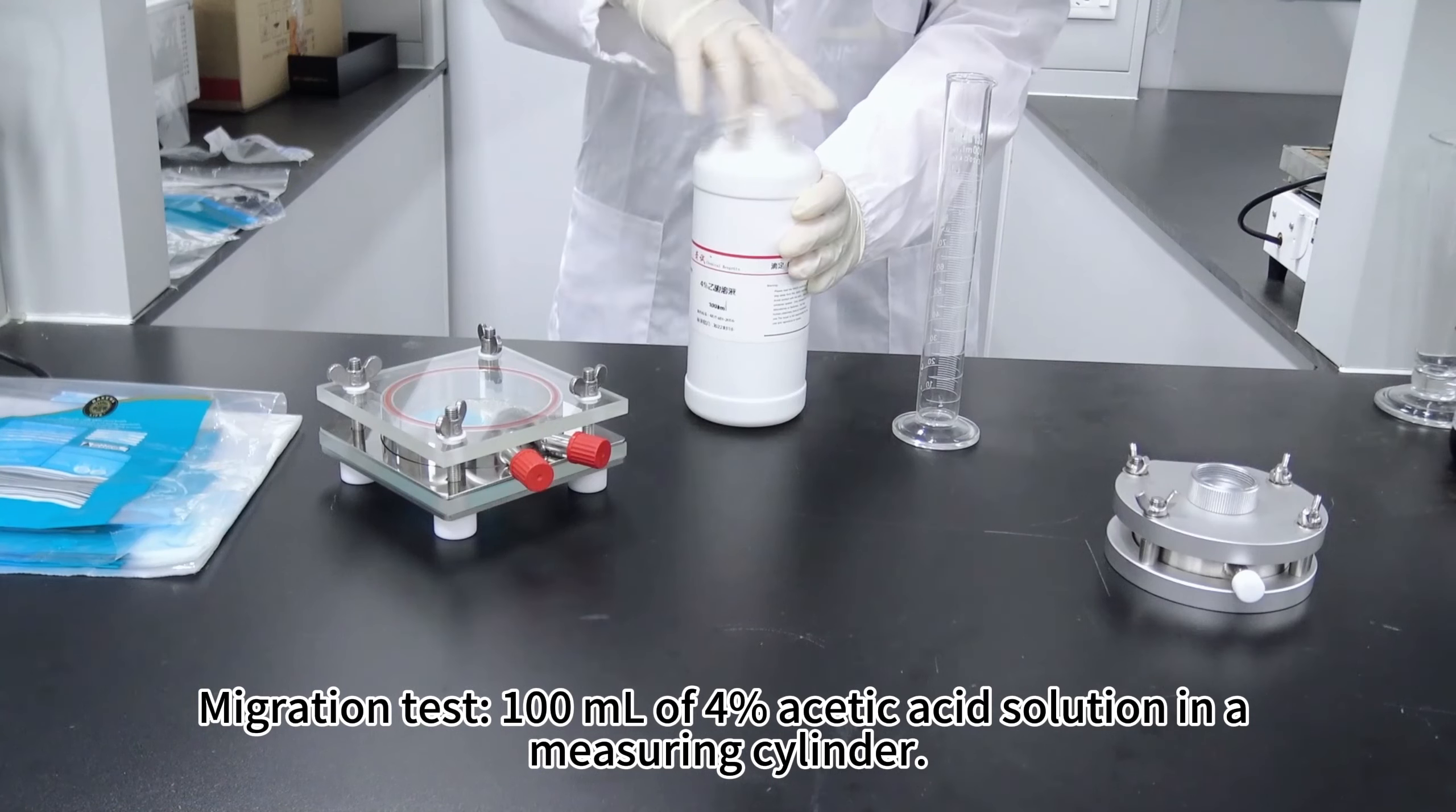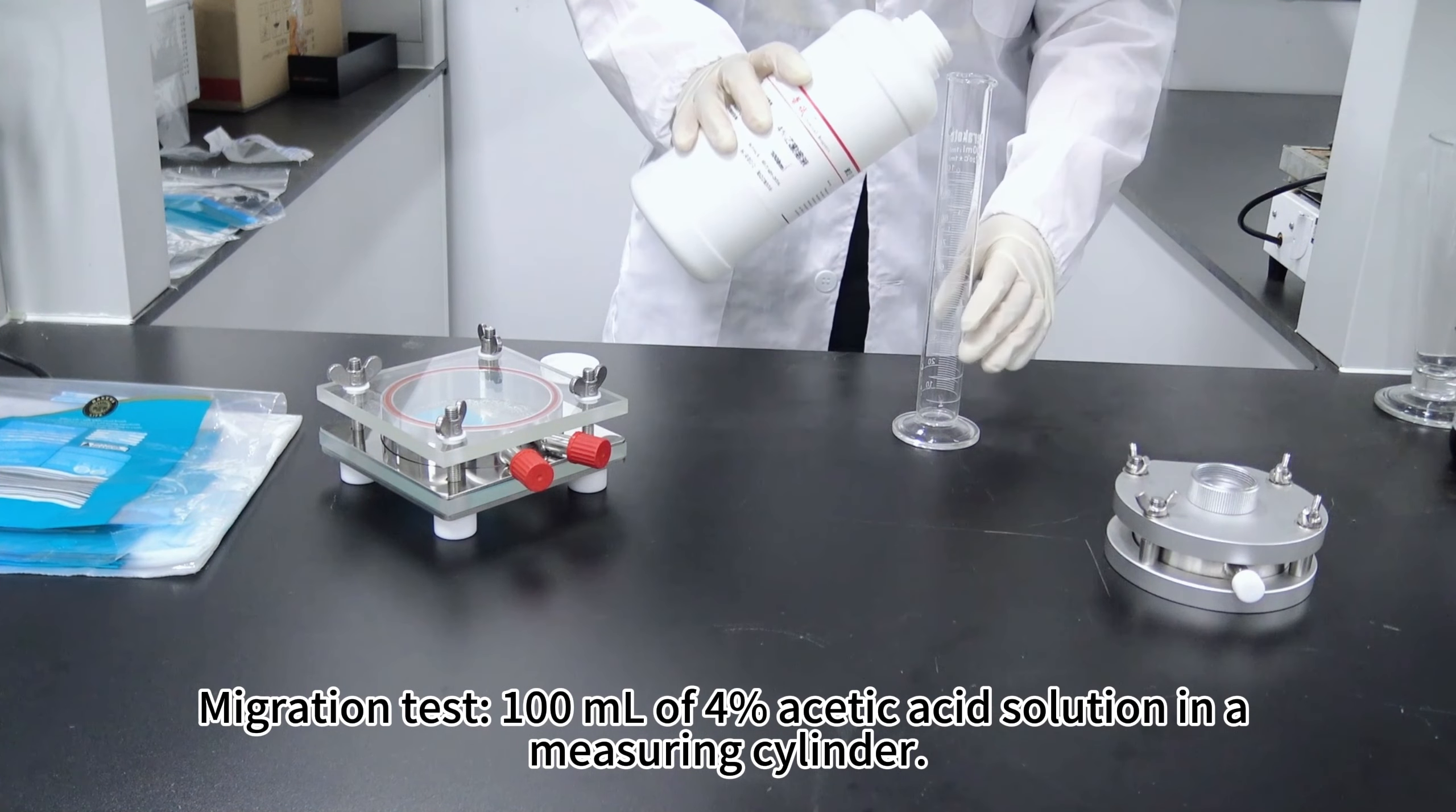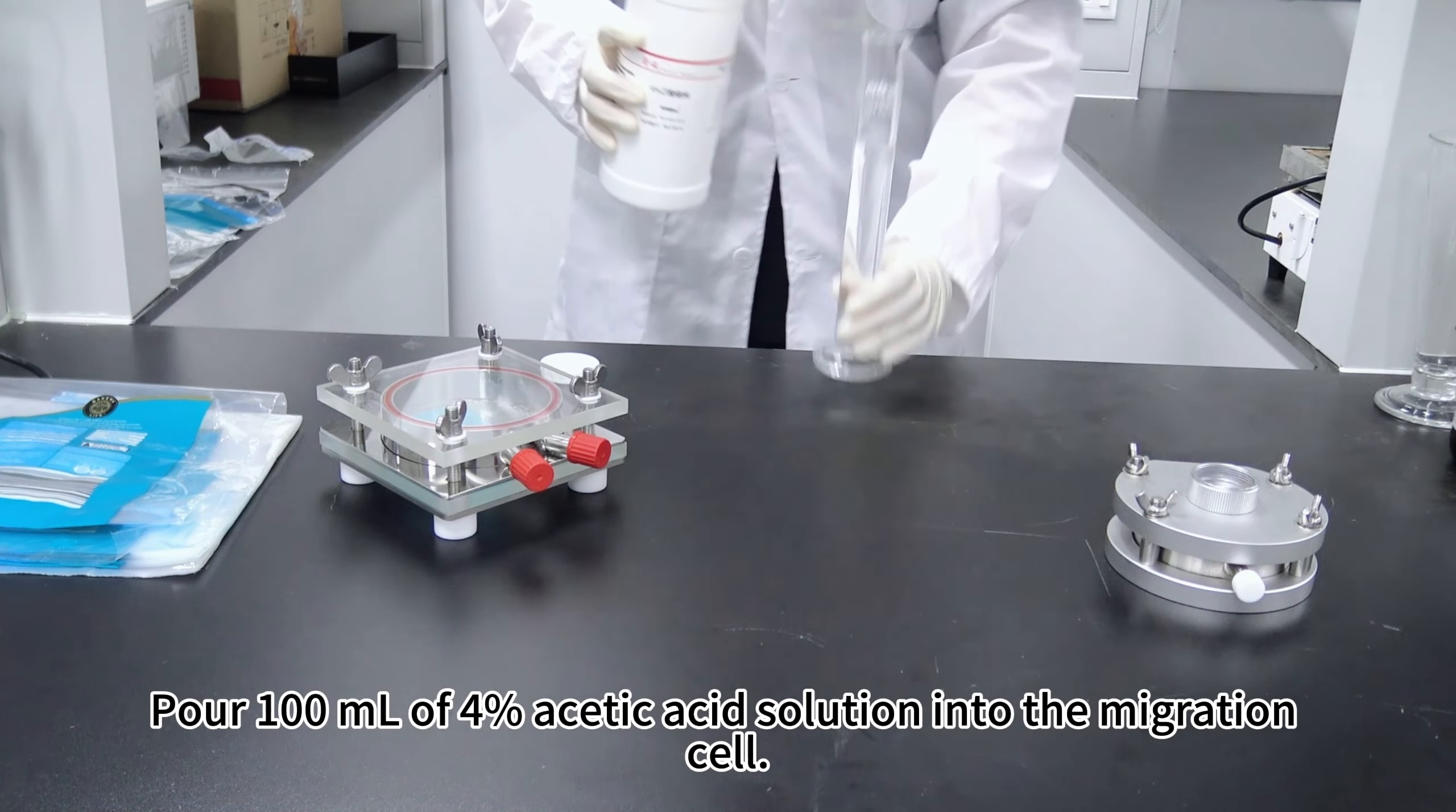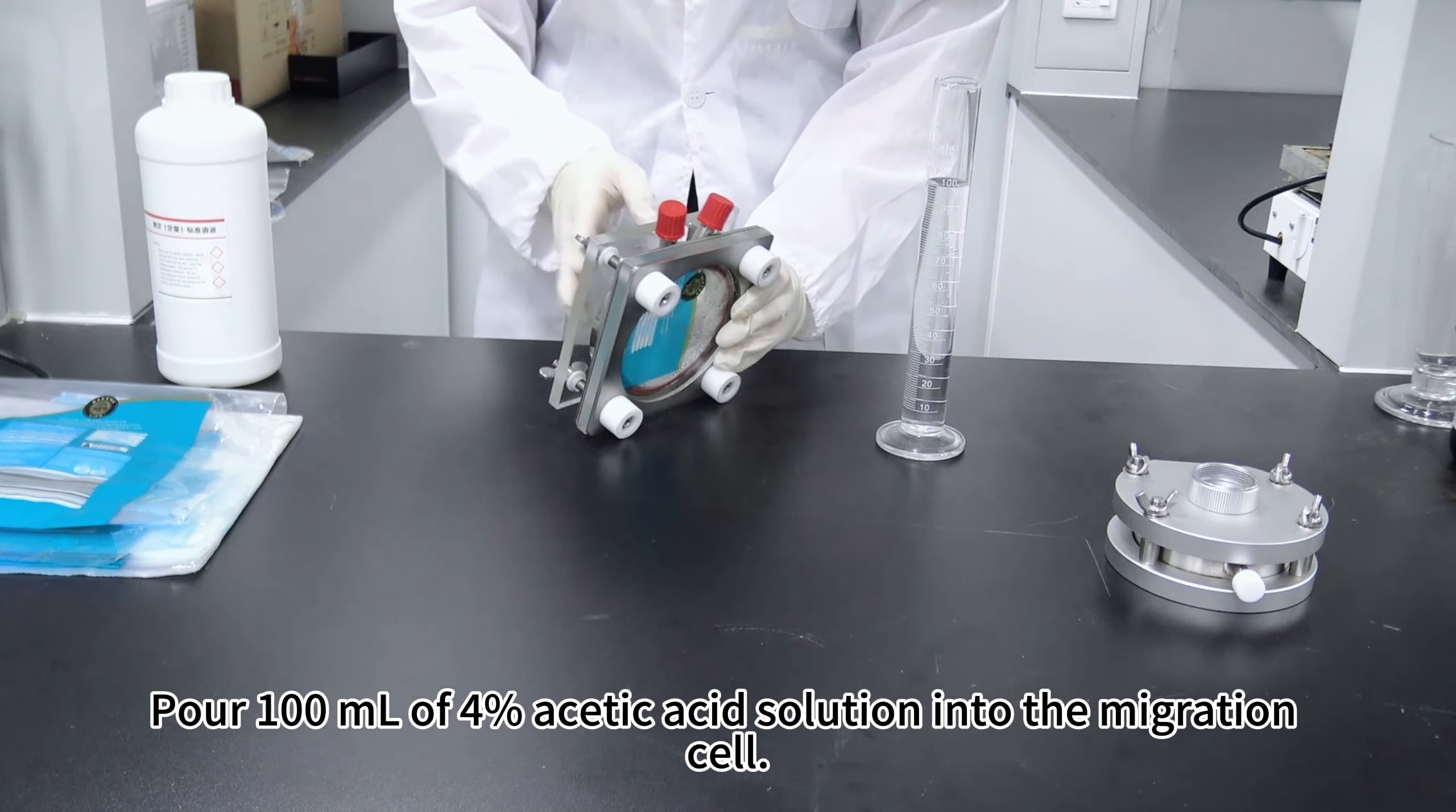Migration test: measure 100 milliliters of 4% acetic acid solution in a measuring cylinder. Pour 100 milliliters of 4% acetic acid solution into the migration cell.